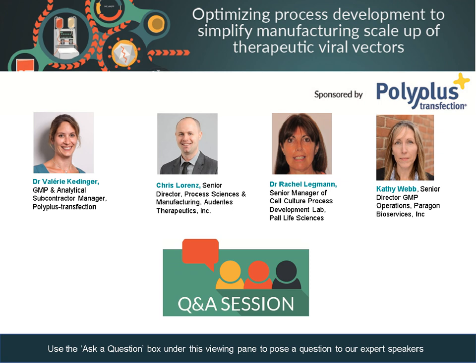Yes. As we said, when we are moving to a scale-up process, it presents different, unique challenges for transient transfection especially. We found that when you are mixing and creating the complex at a small scale, it's very easy. You get very consistent results and variability is really low. But once you start scaling up for commercialization and GMP production, then the mixing is really critical. Think about it: you are working with very large volume, high number of cells. Everything is enlarged in terms of magnitude.